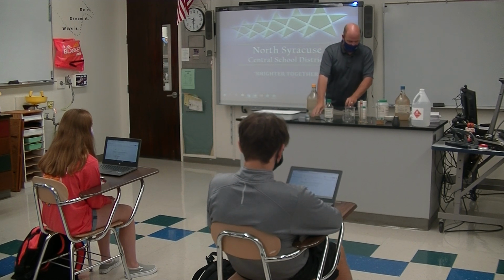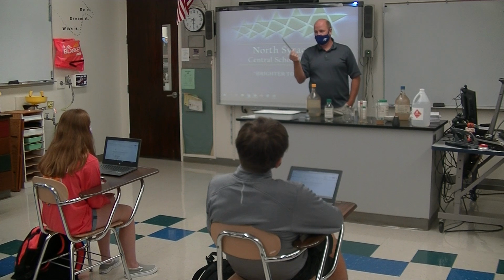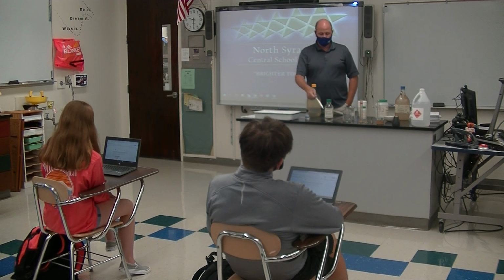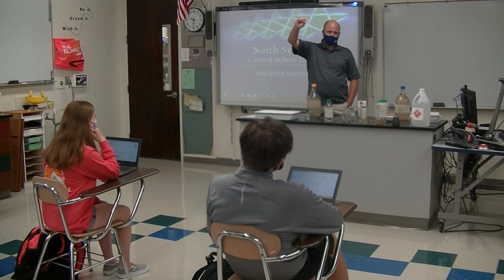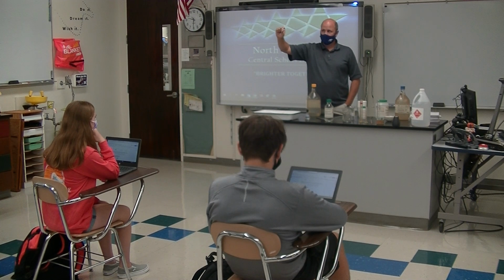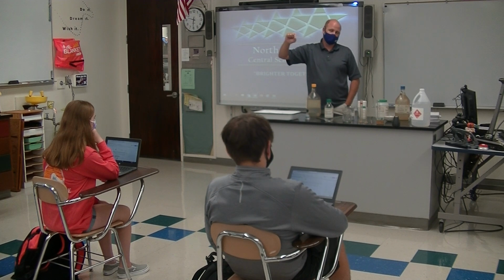And then our second to last instrument that we're going to talk about today is called a scoopula. In chemistry, we use it for lots of things. We use it as a spoon, a stirrer, a knife, a poking thing to break things apart. Have you guys ever seen one of these things before? These things are used to transfer liquids. These are called pipettes. This is a plastic pipette, this little bulb we can squeeze, and then you put it into a liquid and it'll suck liquid up into it, and then you can squeeze it out and push the liquid out.